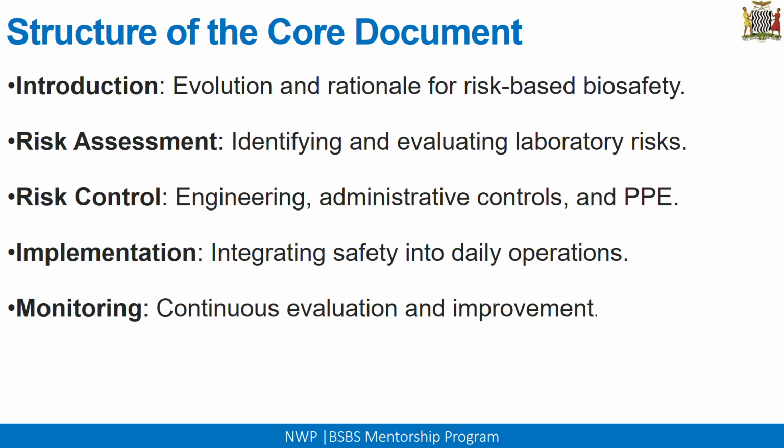Now there's an introduction where it introduces the evolution and how do you make sure that whatever you're doing is focused on the risks and not on the prescriptive guidelines that were available in the other versions of this document. Then it also looks at risk assessment. So under risk assessment, this is where you're identifying and evaluating your laboratory risks.